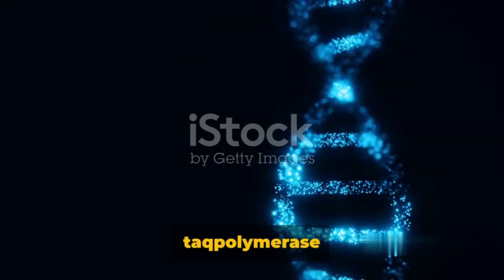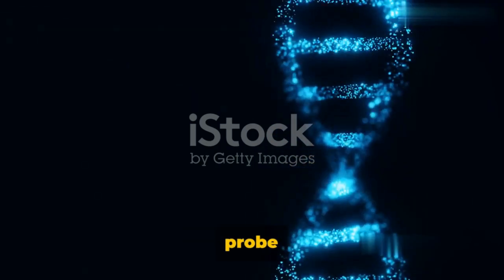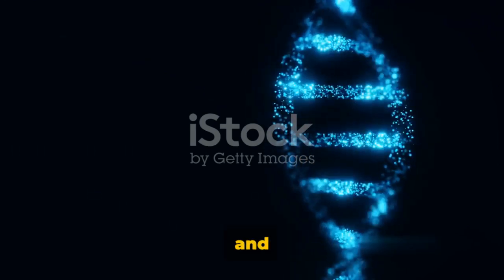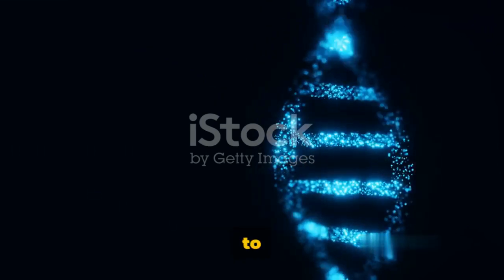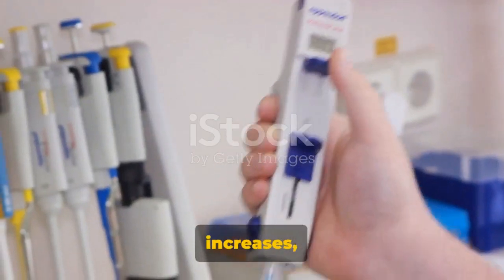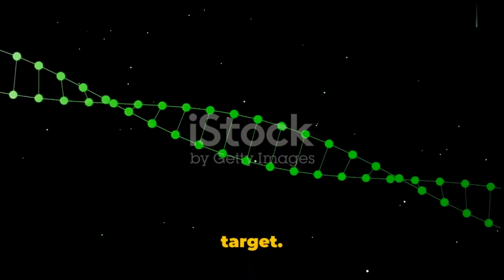And as the Taq polymerase starts synthesizing new DNA strands, the probe degrades, separating the fluorescein from the quencher and allowing the fluorescent signal to shine through. As this process repeats, the fluorescence increases, indicating the successful amplification of the target.